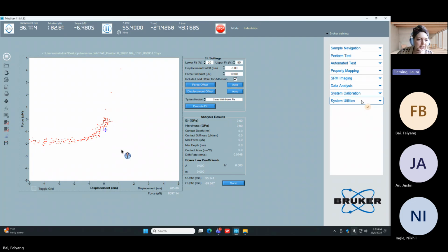Okay, and now you can see all of a sudden it looks like it didn't take, right? Well, that's because we're at 5. So it's going to re-zero, open the next one, re-zero, open the next one, which is handy if you have to re-zero a lot.